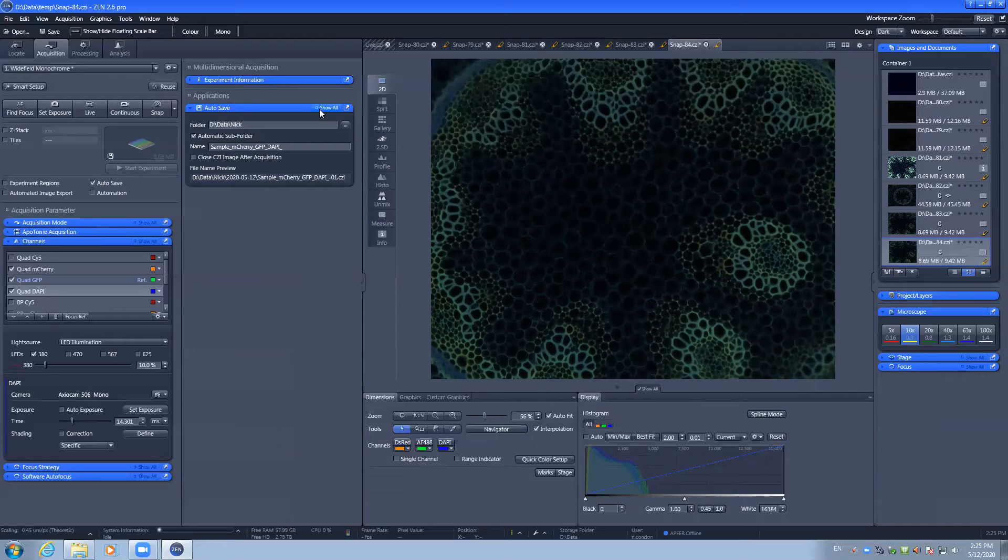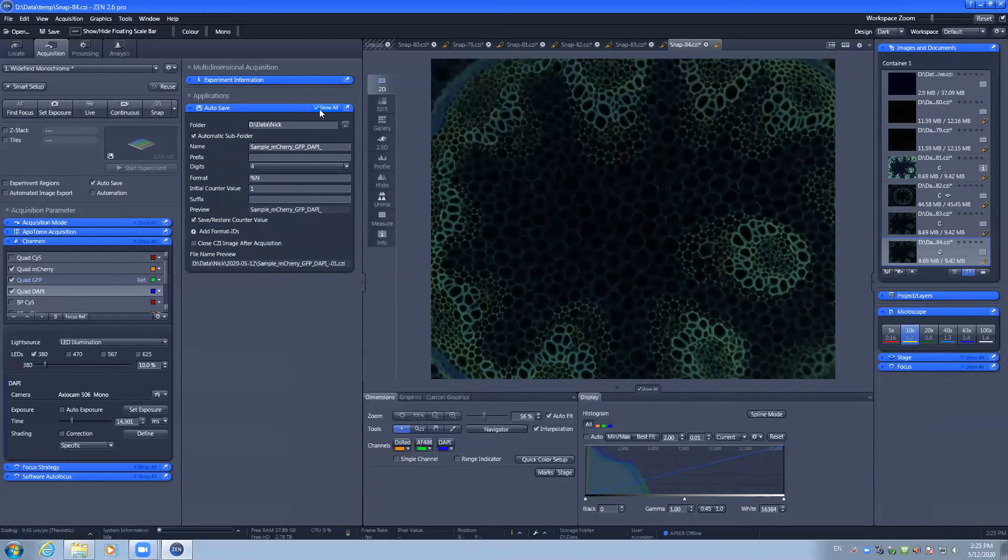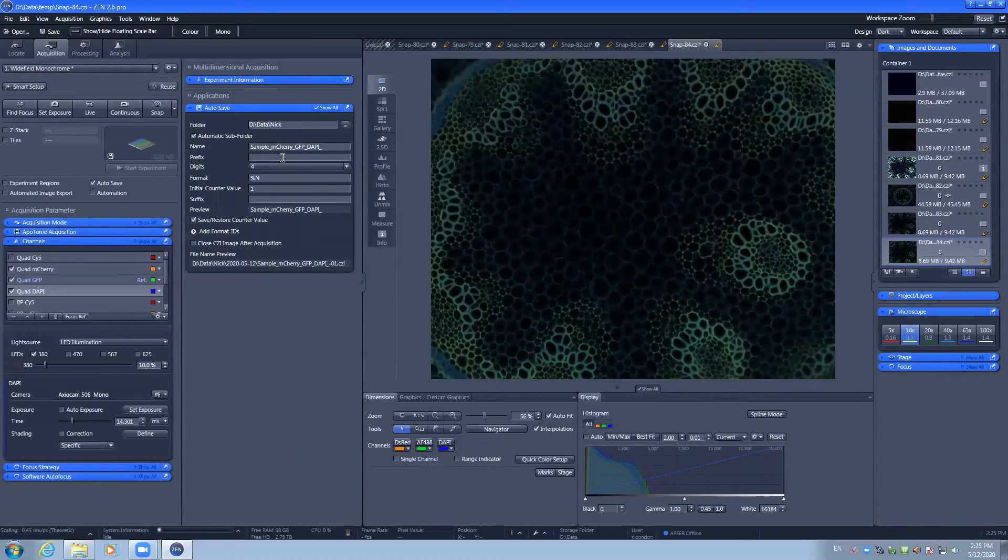Some menus also have the show all option, which lets you see a number of additional options that you may require.